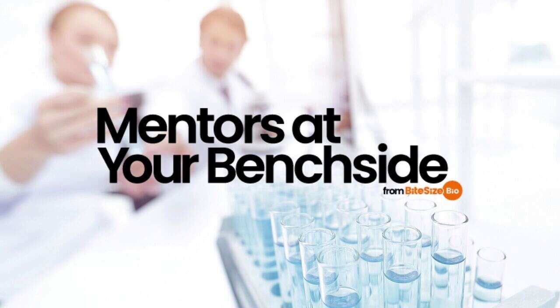Problem number 7. The Ponceau S stain looks great, but I don't see any bands after my antibody incubations. Since the Ponceau S stain looks good, you can safely say the problems seen at the end of the procedure do not stem from the electrophoresis or the transfer steps. Look at your blocking, washing, antibody incubations, and substrate visualization steps to determine what happened here.